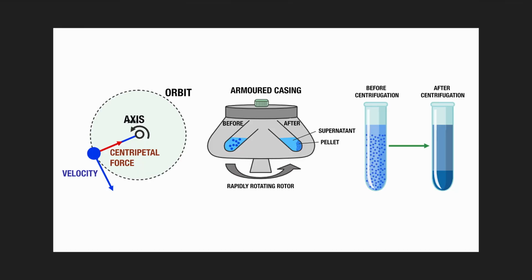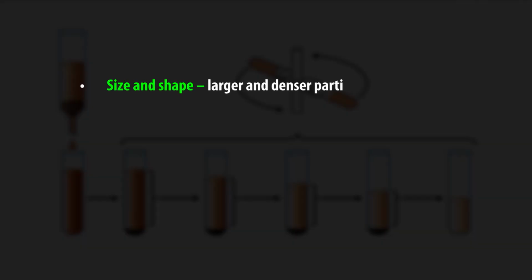Centrifugation. Centrifugation is the driving force behind subcellular fractionation. The principle is based on Stokes' law, which describes how particles sediment in a fluid under gravity or centrifugal force. Centrifugation involves spinning a sample at very high speeds, generating a strong centrifugal field that drives particles outwards. The rate at which particles move depends on their size and shape. Larger and denser particles sediment faster.